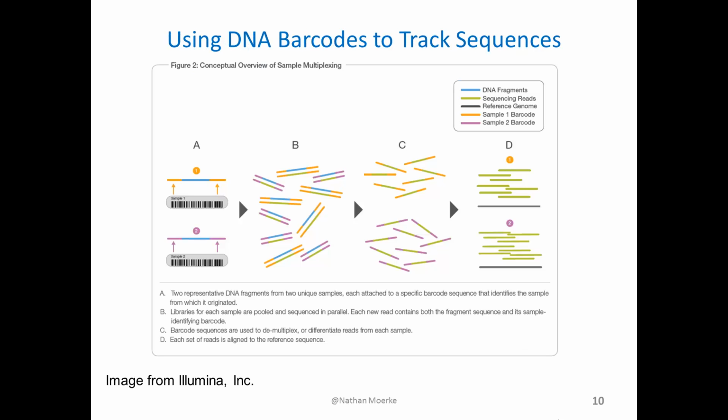The example I'm going to talk about in my demo is that of tracking DNA barcodes. In a lot of next generation sequencing experiments, because the instruments have such a high capacity, you actually are pooling data from multiple patients if you're in a clinical diagnostics lab, or multiple organisms if you're studying basic biology, for example, studying different pathogenic bacteria.